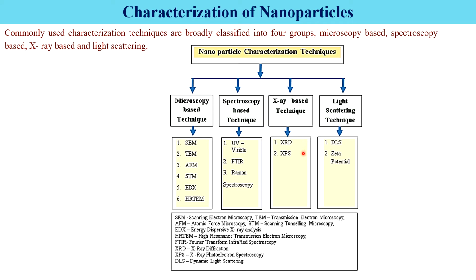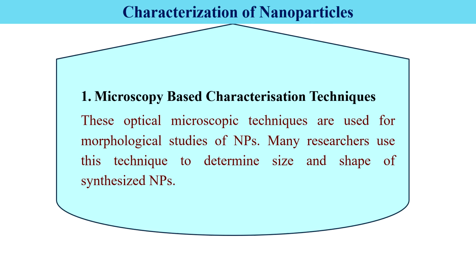These are some X-ray based techniques which are commonly used. Light scattering techniques involves DLS, that is dynamic light scattering, zeta potential, etc. These are some common techniques by which nanoparticles are characterized. And the characterization is the most important part for the synthesis and for applications of nanoparticles.